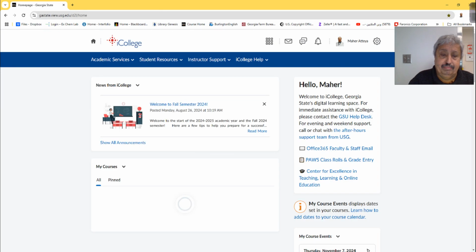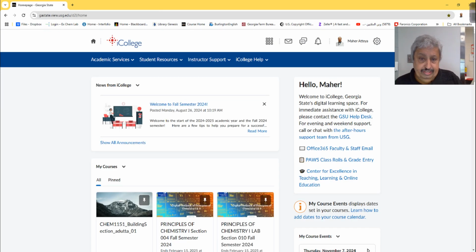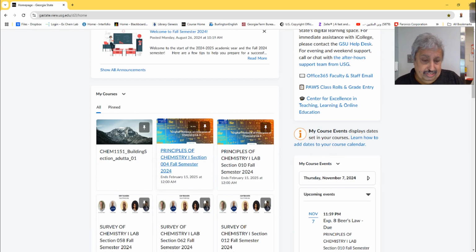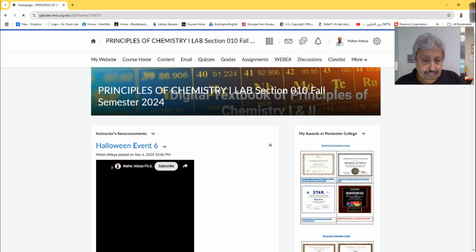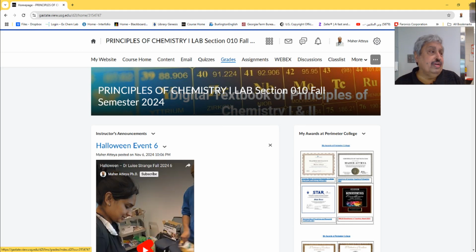Or we might have had some sources of error in the past, and even with this, because this setup has a lot of stuff open. One source of error is the equipment where you generate your CO2. It has to be clean and dry. It has to be clean and dry. If you have impurities, you will add the impurities to the mass of carbon dioxide, correct?